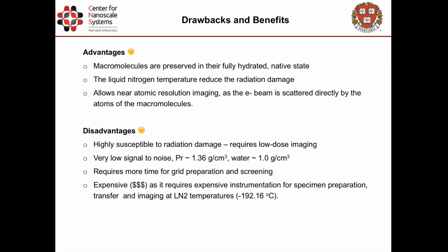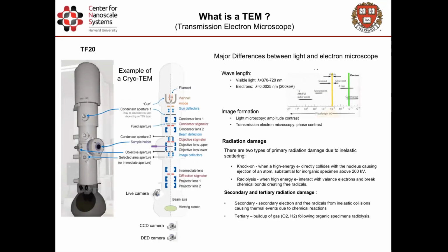Disadvantages: it's radiation damage, the very low signal to noise, it requires much more time and effort to get images and structures than you would with negative stain, and it is quite expensive. It is very expensive. It's not easily accessible.